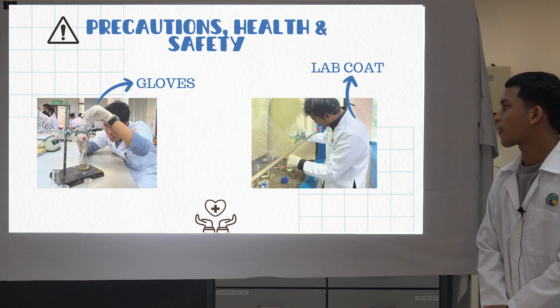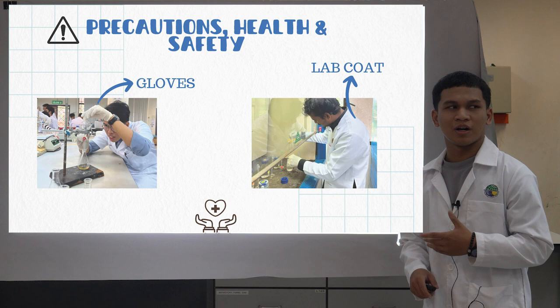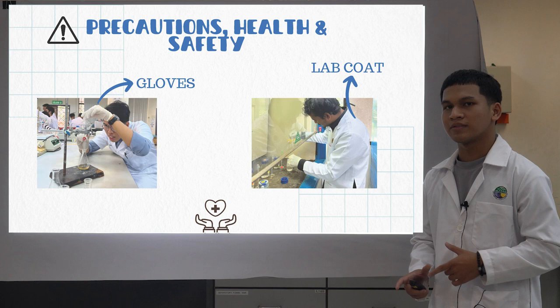And then we wear the gloves because we want to prevent exposure of our skin to hazardous reactions. For example, in this experiment, we use hydrochloric acid and also DCM. It is very dangerous for our skin and might even peel it off.